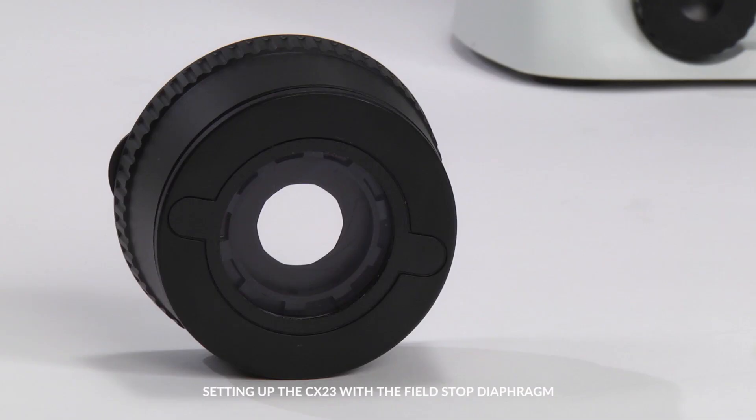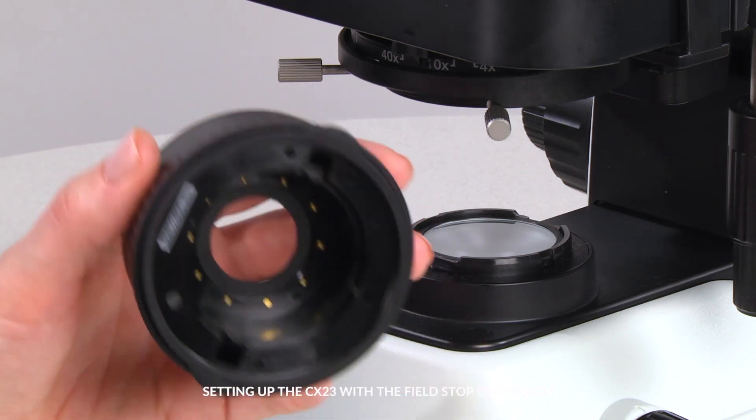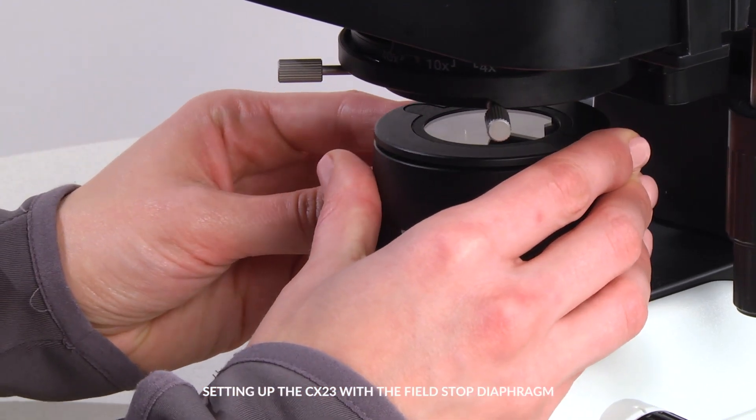Next, insert the field diaphragm by aligning the notches found on the unit with the notches on the LED illumination window. Gently press down on the field diaphragm unit until it clicks.